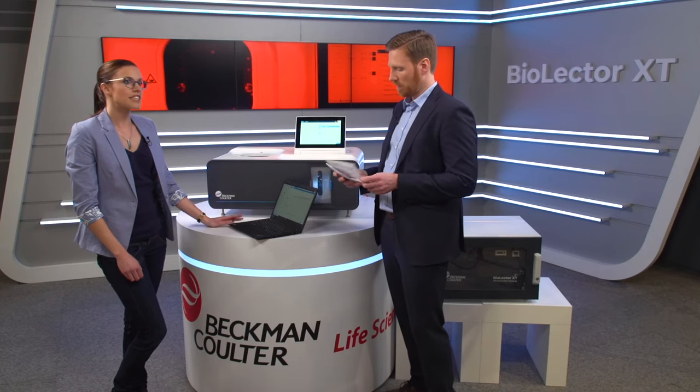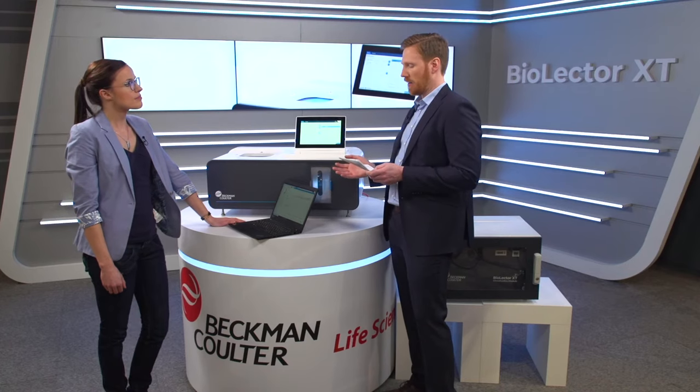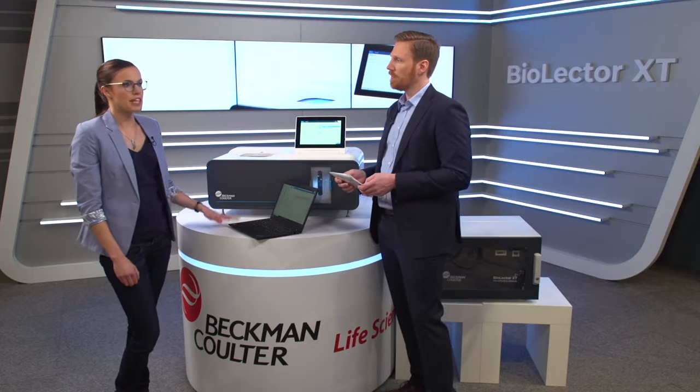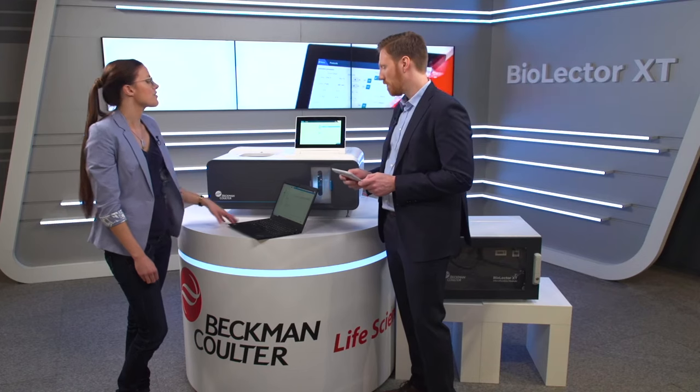For our example, we focus on anaerobic cultivation processes of probiotic bacteria. A main advantage of the new gassing lid is the fact that feeding and pH control can now take place simultaneously during direct nitrogen gassing of the microtiter plate with adjustable flow rates. So after you've prepared your microtiter plate and set up the experiment protocol, what's next? I just have to activate the microfluidic pressure and press start the protocol. Afterwards, the cultivation is immediately started. Experiment status and ambient conditions can be followed on the microbioreactor's monitor at any time. Here, for example, you can see the temperature and the shaking frequency of the current experiment.